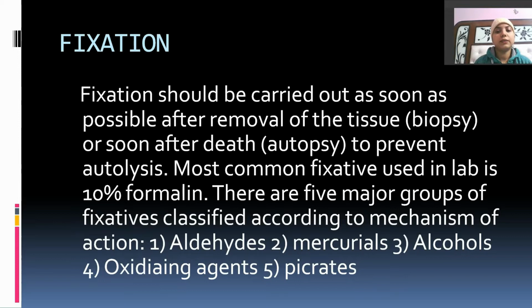The most common fixative used in the lab is 10% formalin. There are five major groups of fixatives classified according to mechanisms of action. First one is aldehydes, then mercurials, alcohols, oxidizing agents, and picrates.